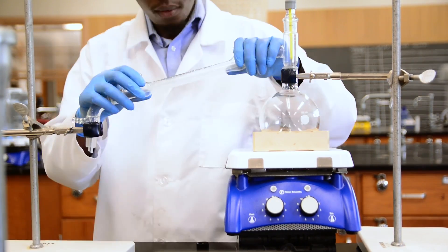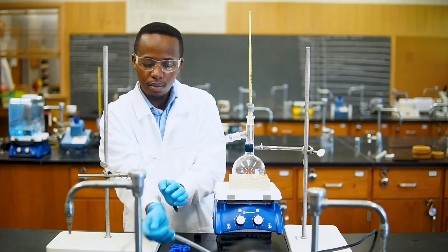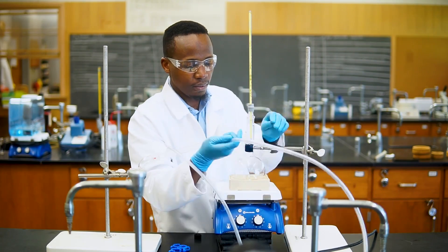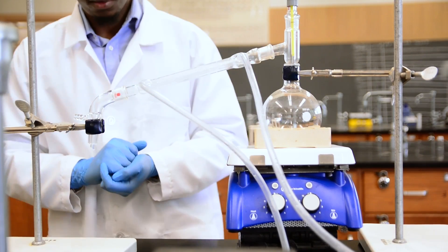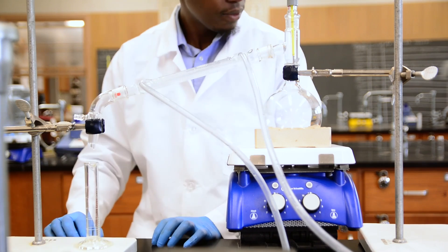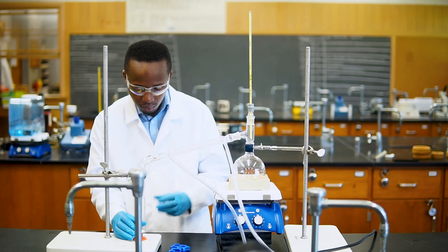We now have support on both sides. To keep the condenser cool, we will run cold water through this outer chamber. The vapor will move through the inner section of the condenser, and as it's being cooled by contact with the glass that has been cooled by the cold water in the outer section, it will begin to return to the liquid phase. On the bottom part of the condenser, let's connect a hose that brings in cold water from the tap, then connect another hose where the water will exit on the top and let that empty into the sink. Let's finish the setup by adding our collector underneath the end of the condenser to collect the distillate as it drips out. In this particular example we are going to be using a graduated cylinder because we want to measure the volume of our distillate as time goes by.